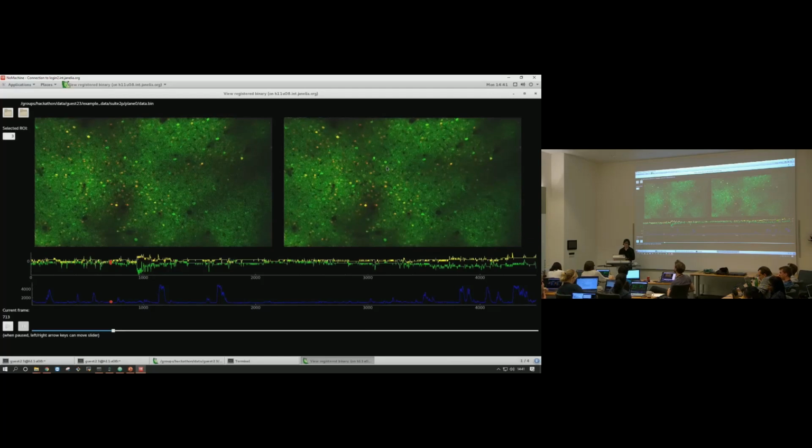So the 0.1, what is it? Yeah, so that's 0.1 times the size of your field of view. So if you have 512 pixels, then it's 51 pixels. That's a max shift of 51 pixels. And if you're getting shifts bigger than 51, then it won't correct them. It won't correct more than that. And hopefully you're not getting shifts more than 50 pixels.